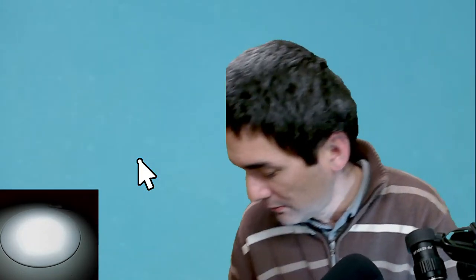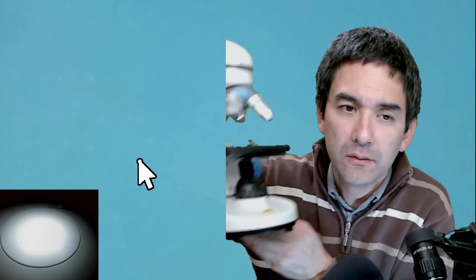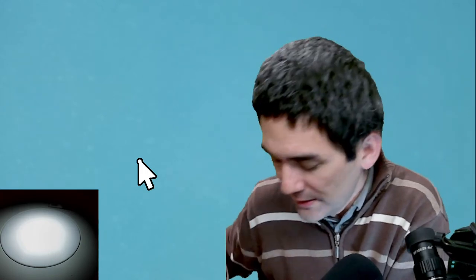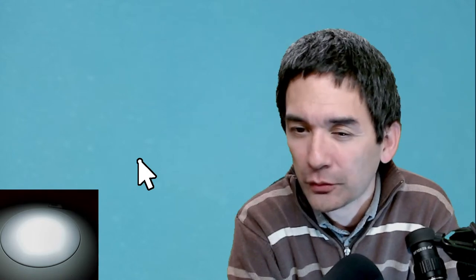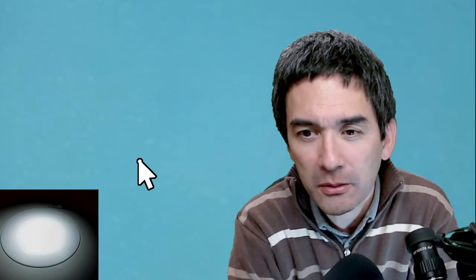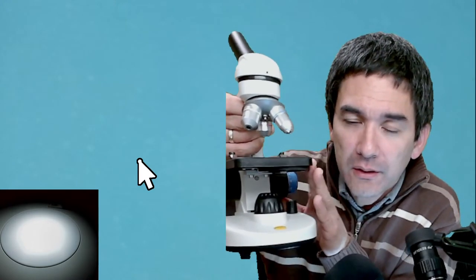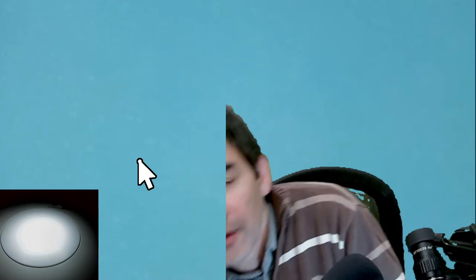On the Swift SW150 for beginners: it belongs to the introductory microscope category. I generally recommend starting simple — after a few months you'll know much better what you want. The SW150 is not a toy microscope; it's a perfectly good introductory microscope. One characteristic to note: it doesn't have a condenser, so image quality isn't quite as high as with a condenser, but it's sufficiently good.